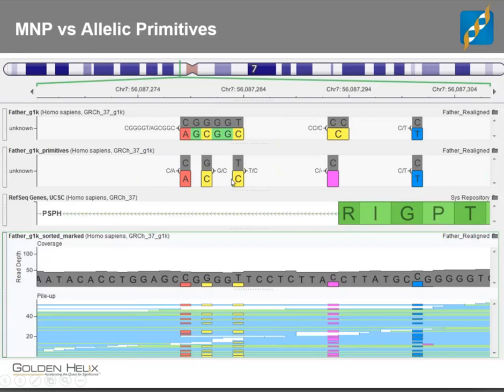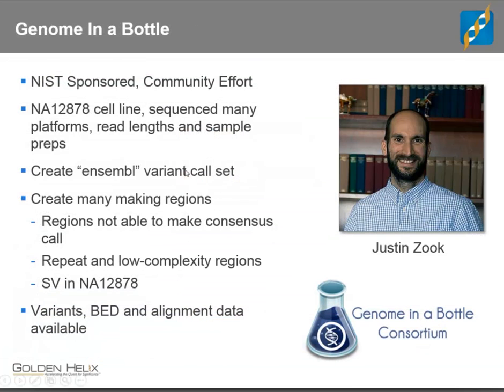And it would be nice if they could go back and forth. And if you have good phasing information stored with these mutations, you potentially could. The tool used to do this, by the way, there's a number, but the most popular, I would imagine, is called VCFlib, and it has a command called allelic primitives, which will take this VCF file and essentially create this VCF file that we're looking at in Genome Browse.